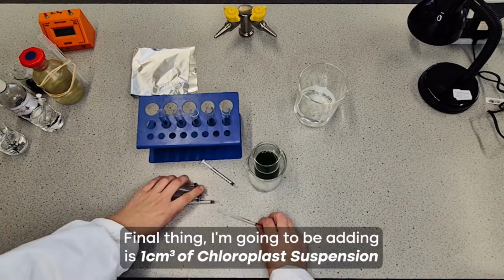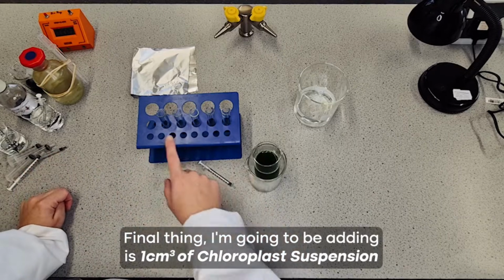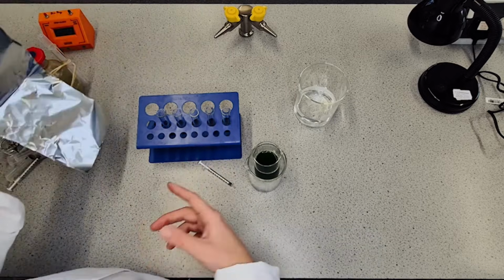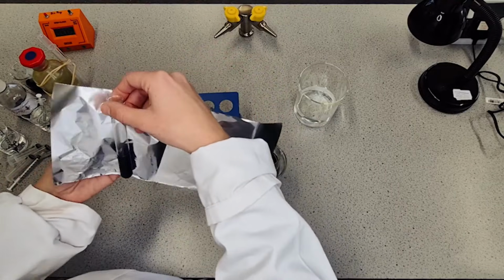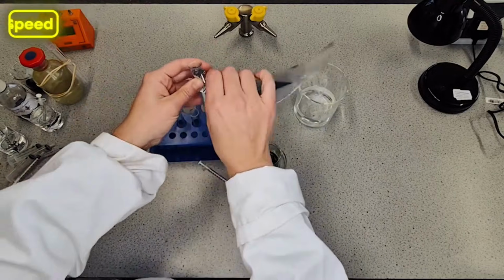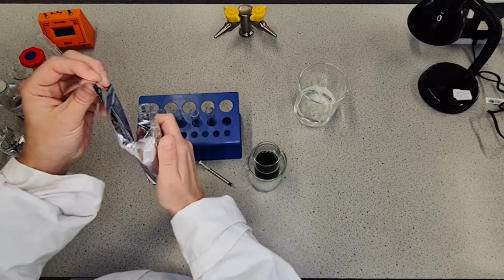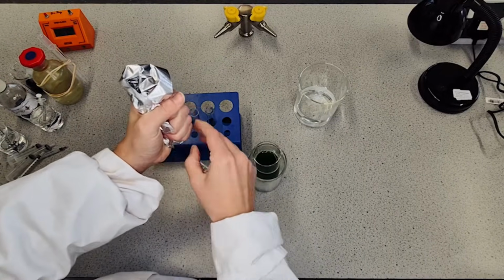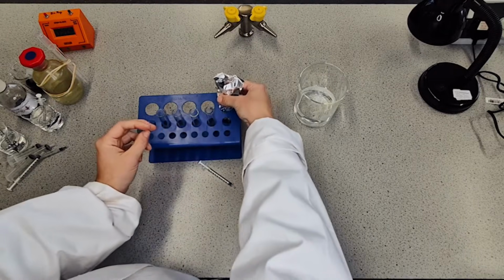So the final thing that I'm going to be adding is 1 centimetre cubed of the chloroplast suspension to all of the test tubes apart from B. As soon as I do that though, the reactions will start. So I'm actually going to prep my tube A now. This is one that needs to be completely covered. I'll leave a little bit spare on the top where I can cover it afterwards once I've got my solution in.